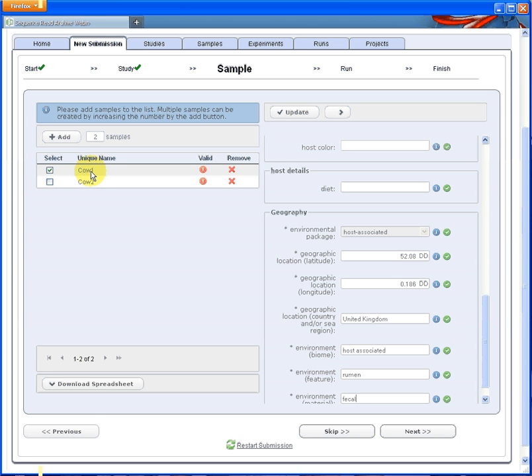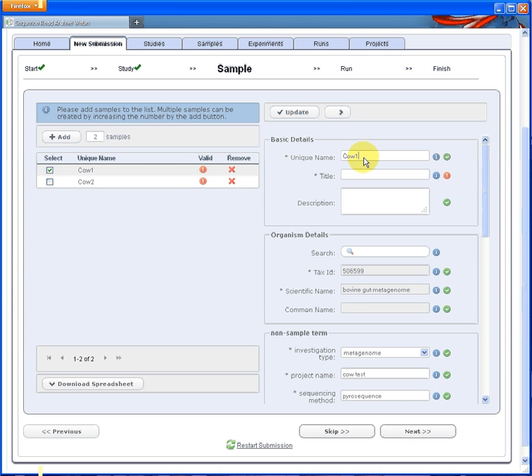You can change the name if you have a more specific name, or if you wish to simply alter it by adding in there. Each sample will require a type, and a full description of the sample. For human consumption, so this is the human readable description that's given with each sample on the web pages once it's public.